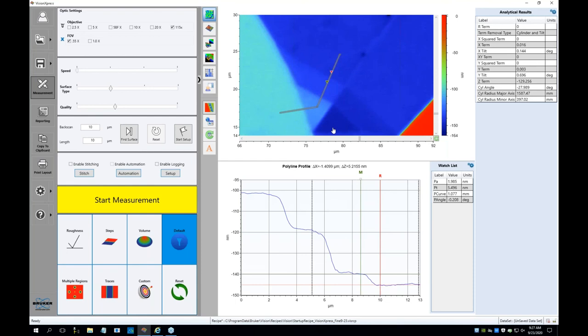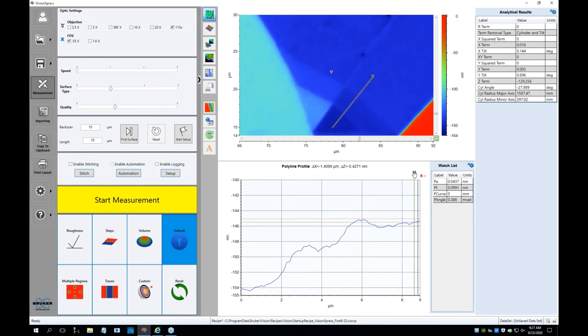And in that case, you have even smaller differences, which is around 2-3 nanometers. So this is how the technique works and how easy it is to operate nowadays with white light profilers. So I can open up the questions over there.